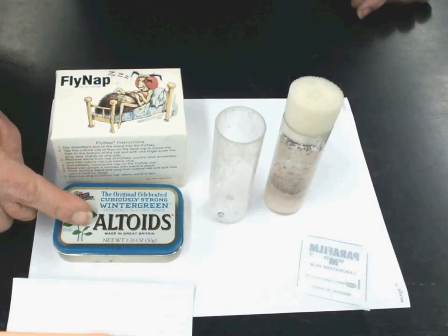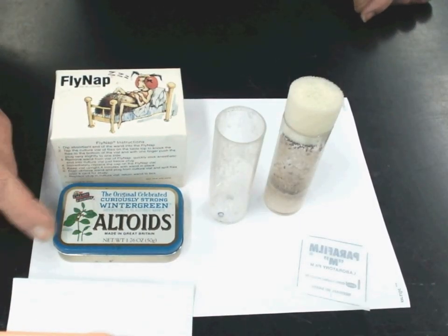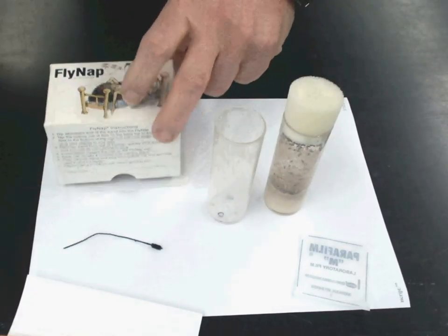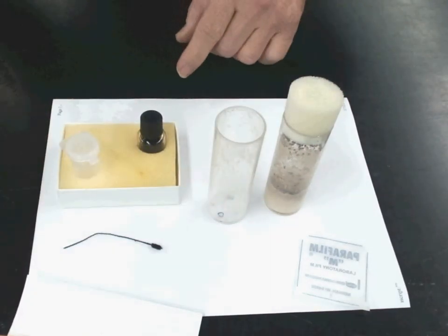Inside the Altoid box here, you're going to find these fly wands. They look like this. And inside the fly nap box, you're going to find the fly nap and another container. This is the fly nap.